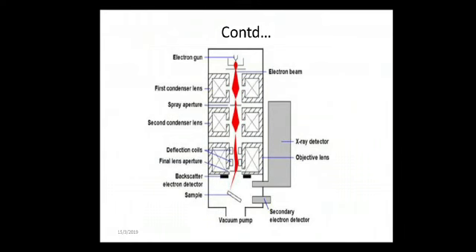There is also a risk of radiation exposure associated with the electrons that scatter from the material surface. Another disadvantage is that scanning electron microscope operators and researchers are usually advised in most institutes to observe safety precautions against exposure to X-rays. X-rays are high radiation, so safety measures are required.